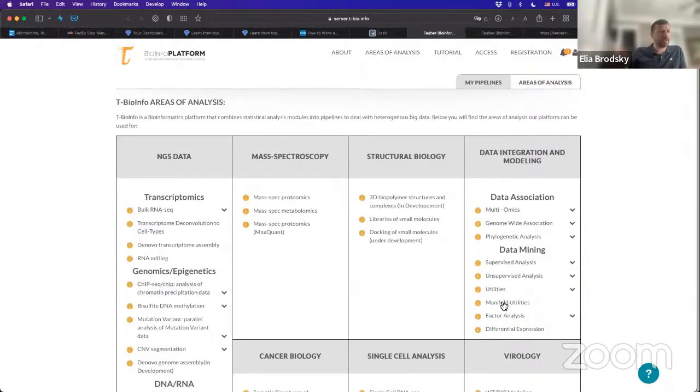So I'll pause here. Thank you, Ojasvi, for sharing the link. Please let me know, those that are participating and want to follow along, if you were able to get into this link. And also, if you hover over this profile, if you can see your email address here on top, so you know that you're logged in. And maybe you can share that in the chat. Yes, no, maybe something like that. So I will give you just a couple of minutes, and then we will go on from there.